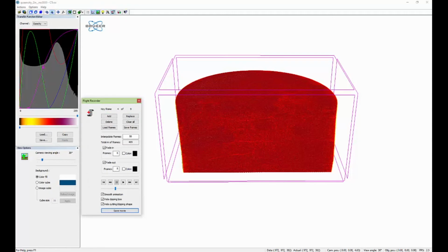And you can see how much faster that was than going through and animating all the steps that we did for the first sample. Likewise, we can keep applying this to any number of other samples. So hopefully you can see how this will save you time and help keep your projects consistent when you're animating samples. If you have any questions, please reach out to us here at Microphotonics and stay tuned for next month's installment of the Tip of the Month series.